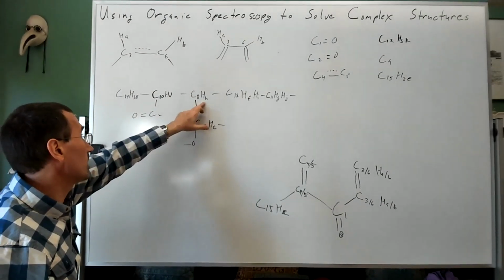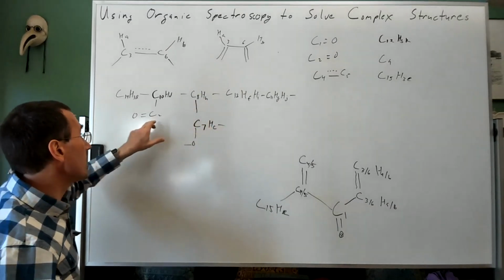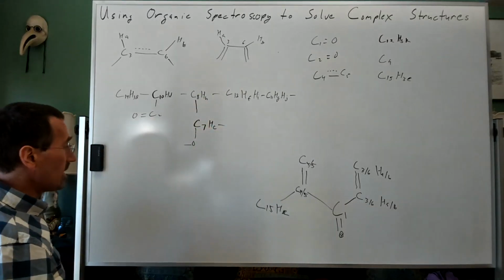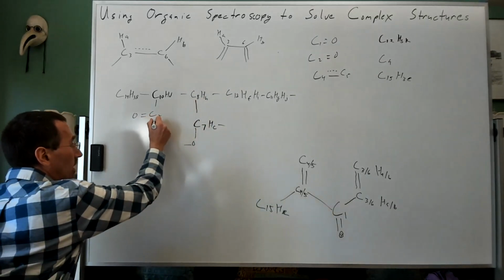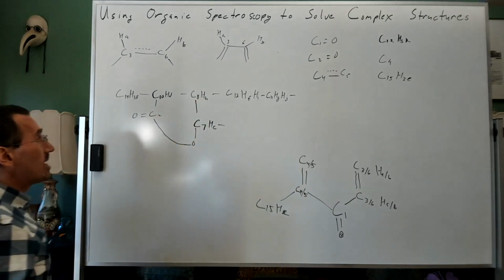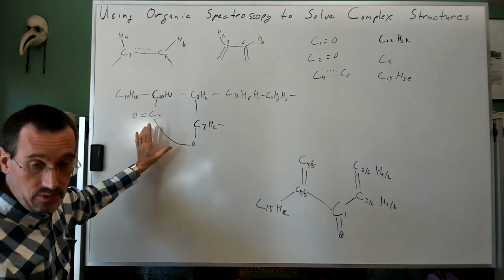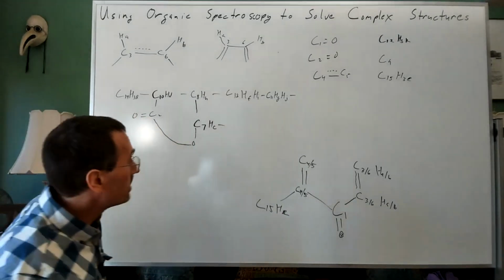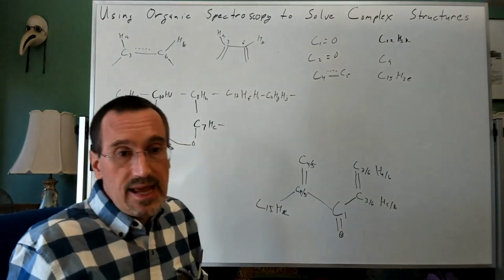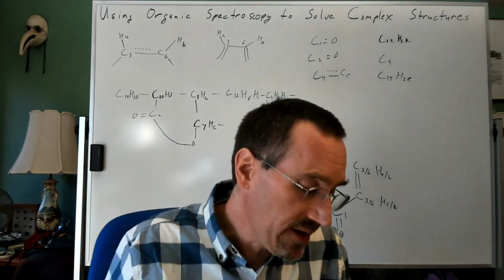So I'm not particularly bent out of shape by not getting a cross peak with HH, but that places this here. We had already been thinking about a lactone, a gamma lactone, and so I might as well close up our lactone. If you don't want to do this at this point, we're going to use up all of our valencies in just a moment. So let me come to the last piece of information that I want to get out of here.